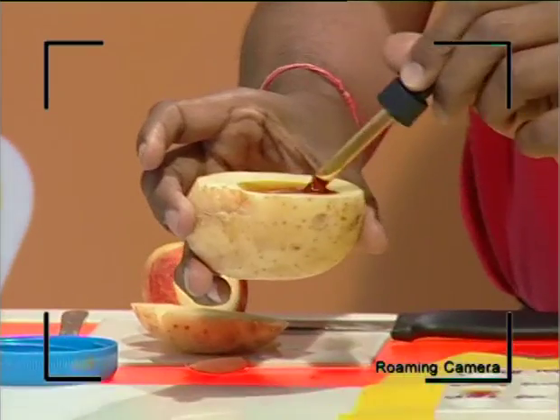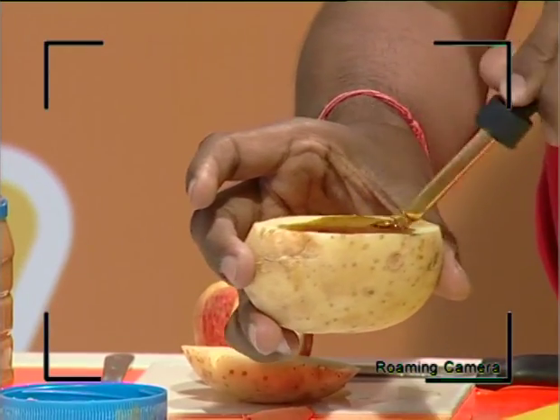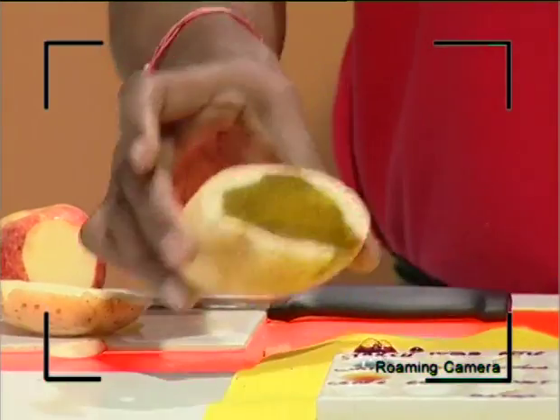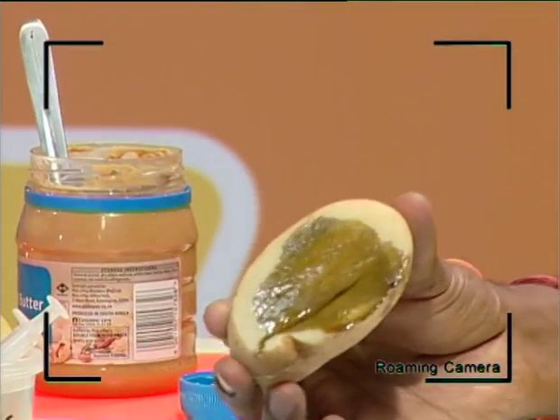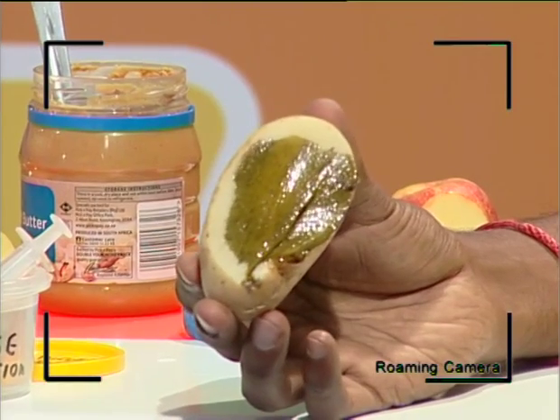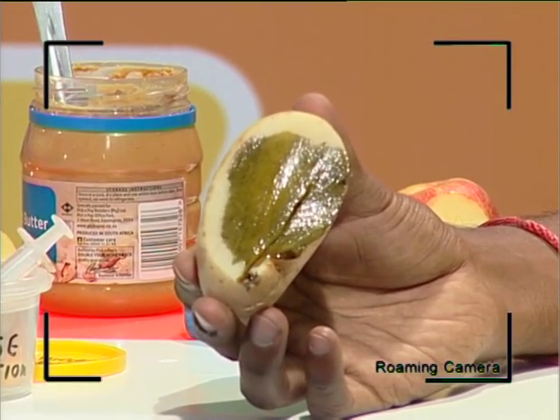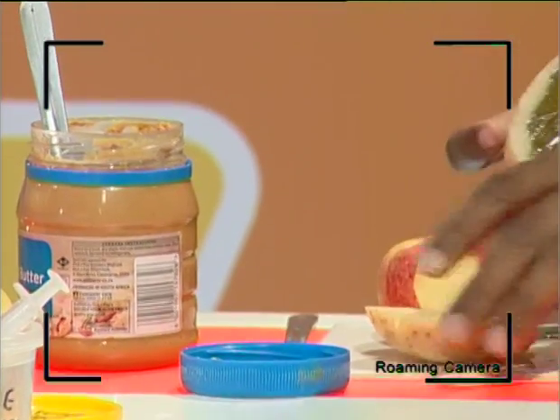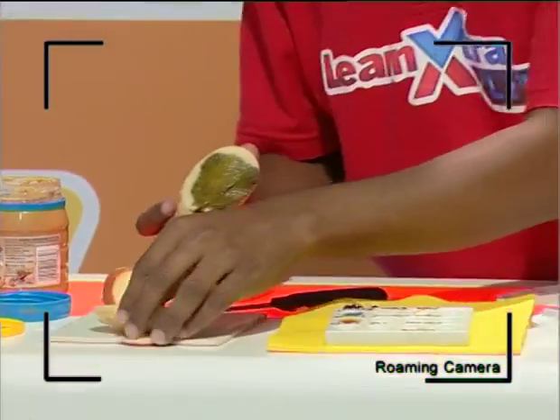Okay. So if you guys can, I'm going to let it soak a bit, and then I'm going to turn it towards you so that you can clearly see. We often end up with spills, but that's fine. Here's a piece of potato that we cut through, and we can clearly see the color of the iodine. I'm going to bring this closer towards you.